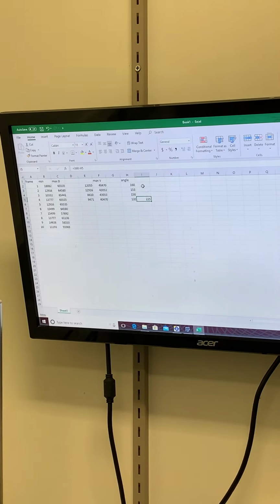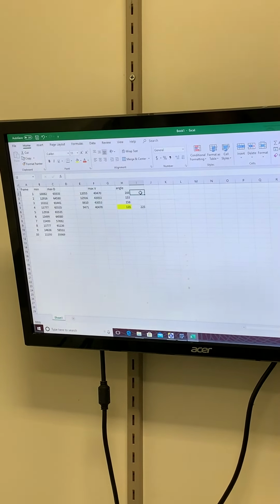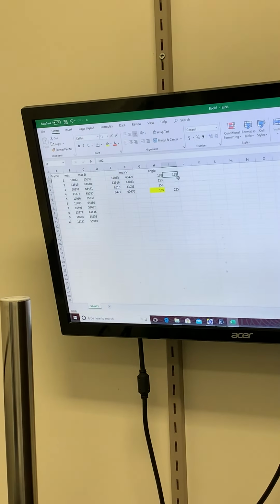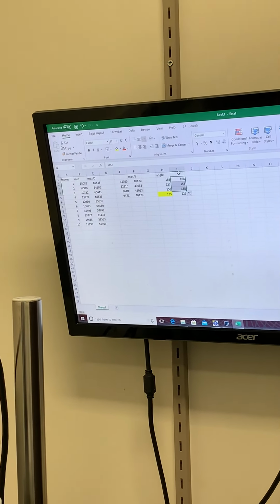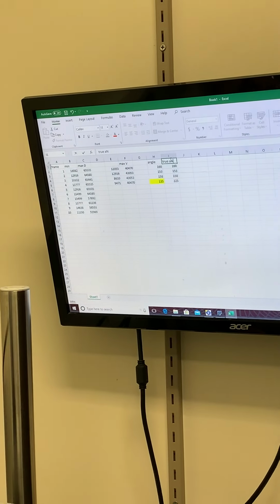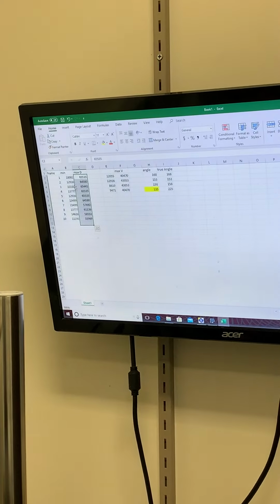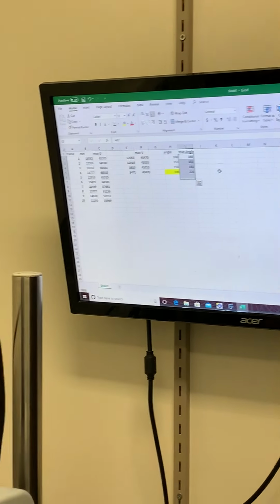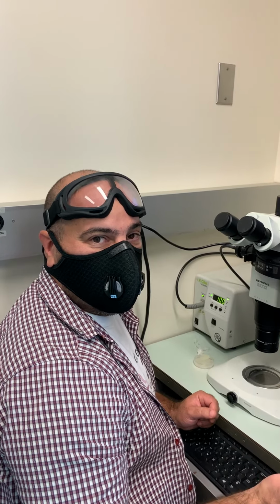And for these angles that are the same, I'm gonna highlight this so I don't know. This one equals H3. Okay, so that angle doesn't change, but these angles will change, and this is the true angle that goes with this. So if we graph this maximum brightness with the true angle, we have a correlation, because the smaller the angle, the brighter the muscle. So they are inversely correlated, the one to the other.